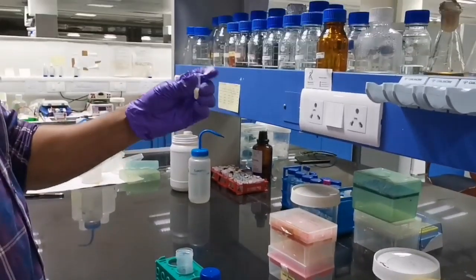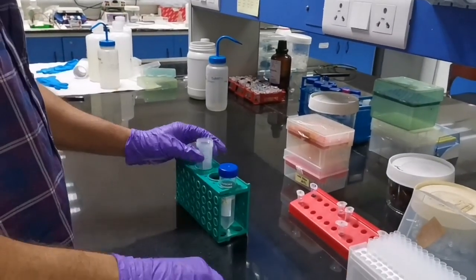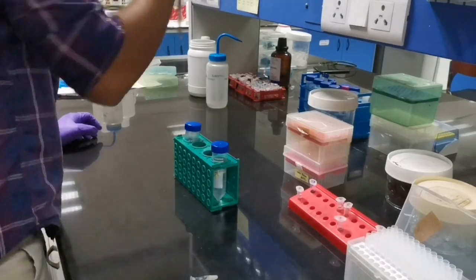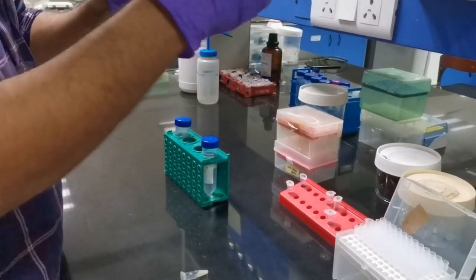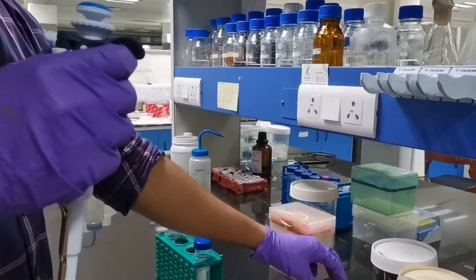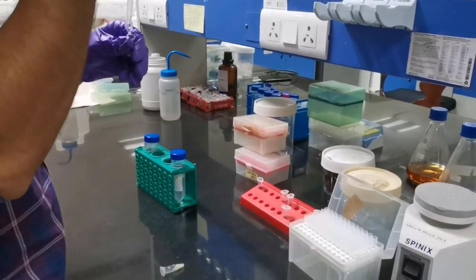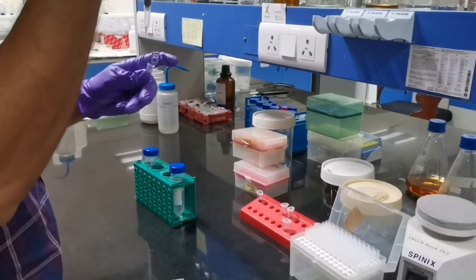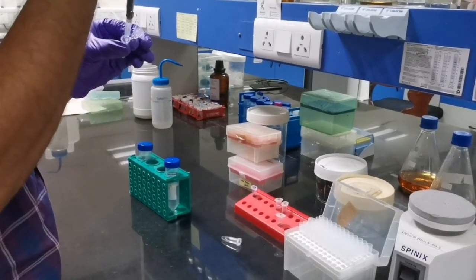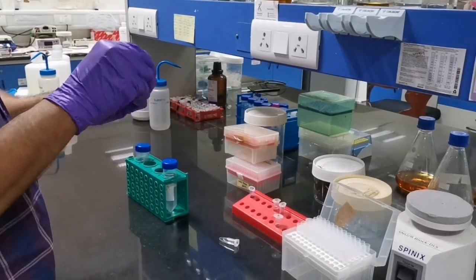I have transferred all the content in the centrifuge tube. Now I will add 300 microliter solution 2, by inverting several times.